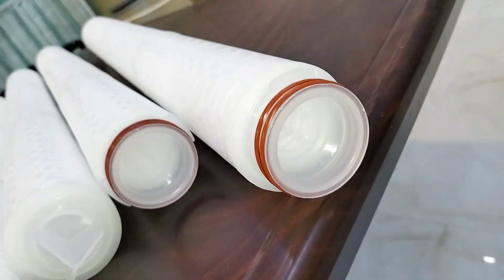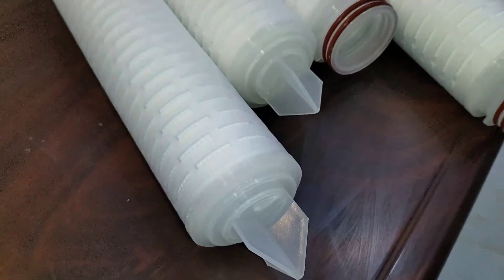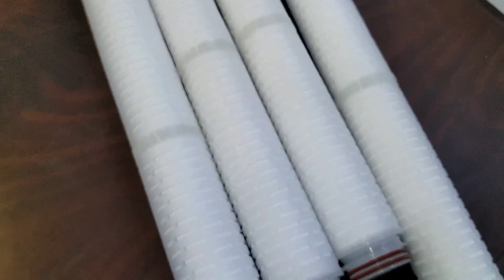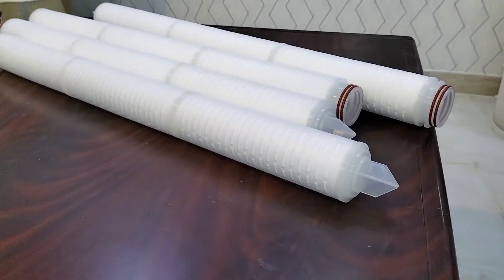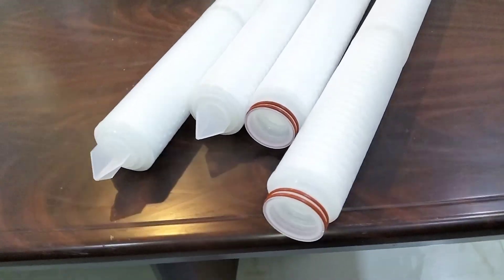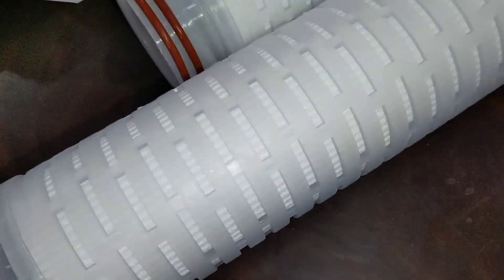We have pleated cartridges available in different micron ratings and filter media as per the customer application. We have hydrophobic filter cartridges, membrane filter cartridges, pleated depth PSE filter media cartridges, hydrophobic PTFE filters, and also nylon filters. These are all deep pleated with depth filter filtration technology.